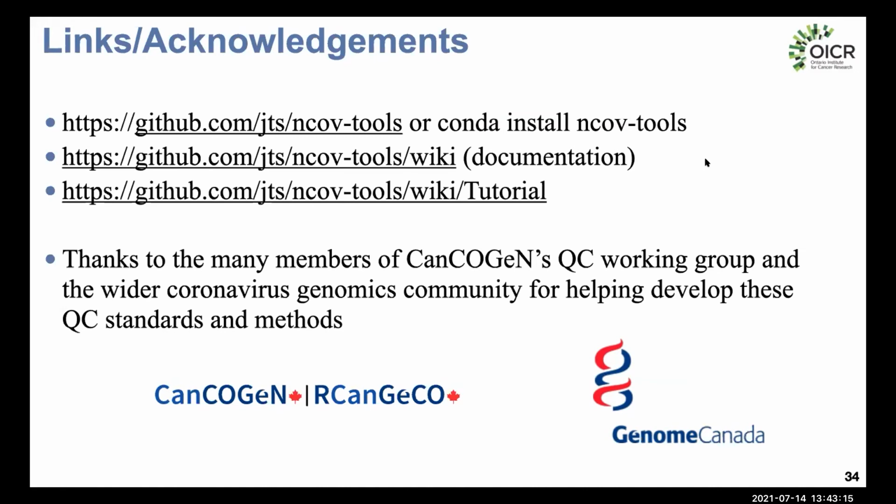Yeah, I agree. And Marina's question follows on from that, which is what do you think about the masking strategy presented by Nicola De Maio? She's linked to the virological post about that masking strategy. Maybe you could just describe what that masking strategy is first, and then say what your thoughts are about that.